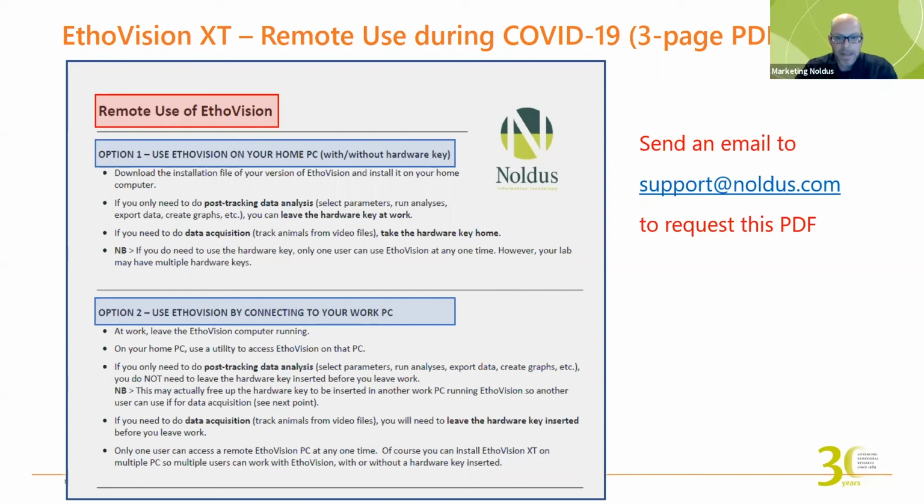All right. How do you delete tracks? Well, in your trial list, you can right-click on the left side and actually delete the track. Of course, now there will be a gap. It'll say trial 1, 2, 3, 4, and then 5 is missing, and then it says 6. That's why I was a big fan of introducing that new column for marking tracks that are no good, and keeping them that way. But yeah, if you want to delete them, you can do that.